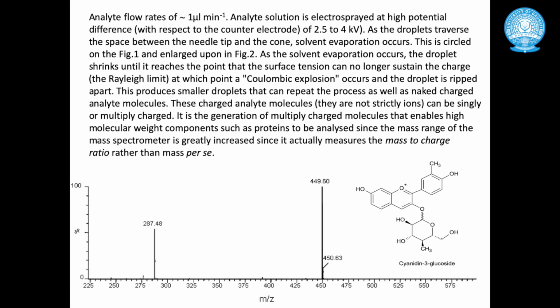So up to this point, what we have understood is that a completely unknown compound can also be studied with the help of a hyphenated technique called LCMS or HPLC-MS, wherein HPLC will separate and detect the compound, and in the MS we will identify the mass of the compound.